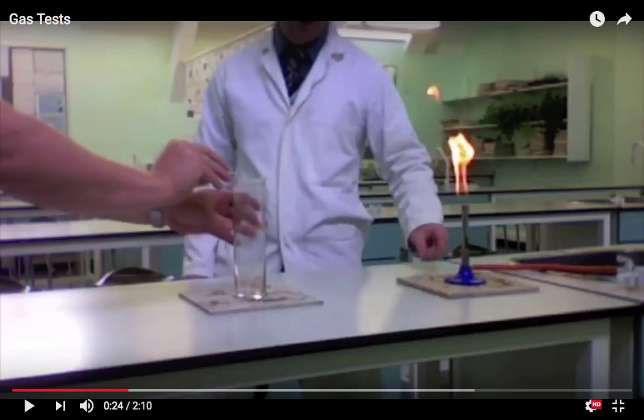Now, this test is really hard for you guys to get a positive reaction for, because oftentimes when oxygen is being produced, so is water, and the water will oftentimes put out your flame before it can reignite. So just make sure you're writing down really good observations, and we can talk about that on C-Day.